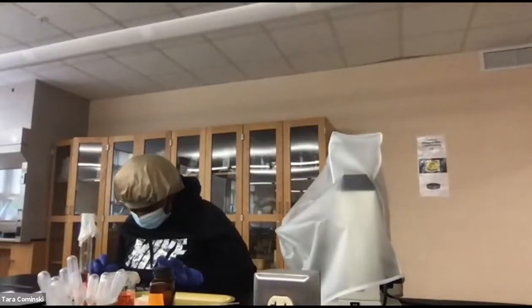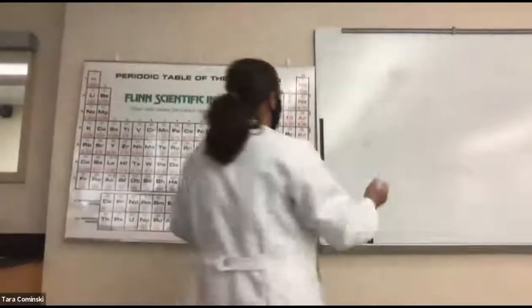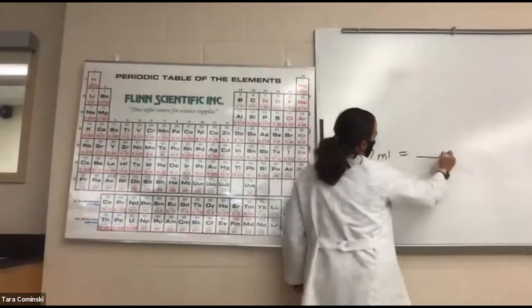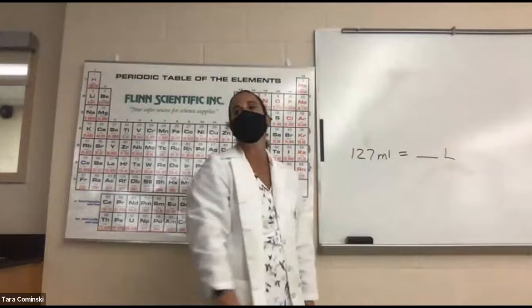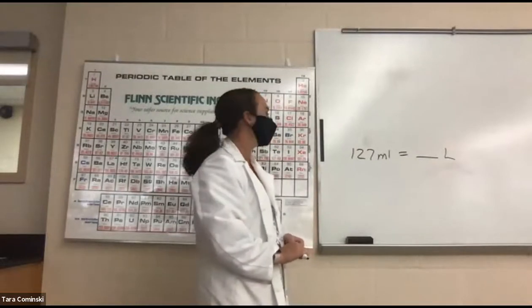So now we're starting with what, 125 or 127? The same thing we just did, right? All right. I have received 0.127. Yeah, 0.127, right? Yeah, correct.